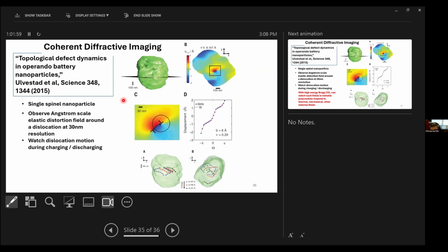Some fundamental point that if there is a way to improve the near field image resolution and the pixel size and so forth, then there might be some way to improve. Okay. New CMOS detectors have smaller pixel sizes, so we're looking forward to working with different detectors post upgrade. Okay. So we can keep you posted on that.